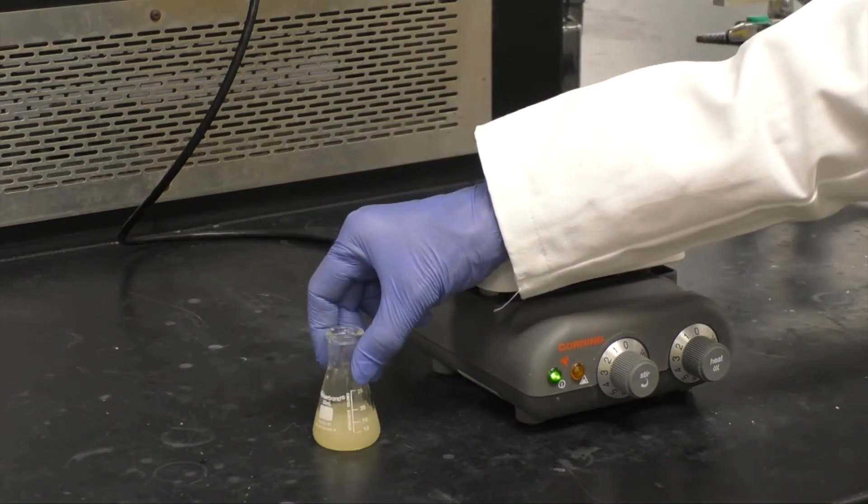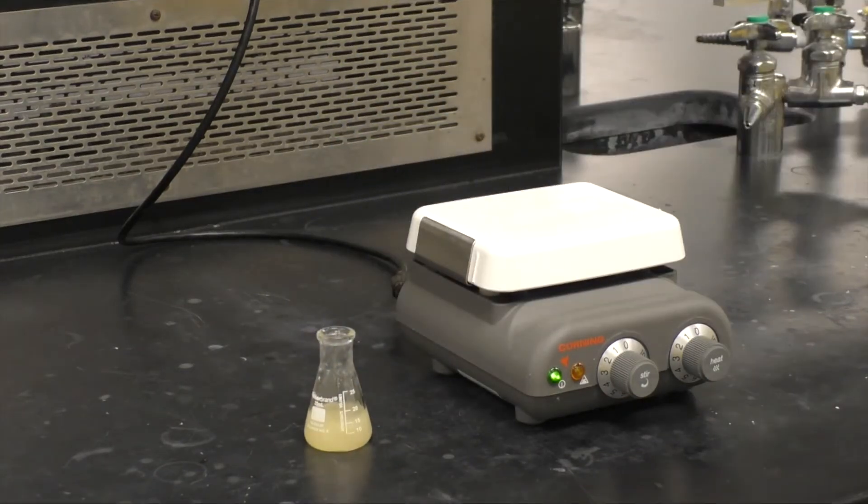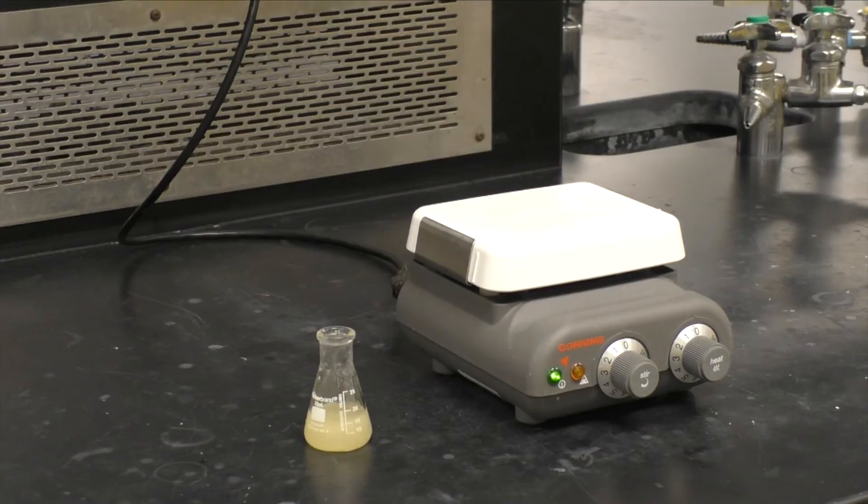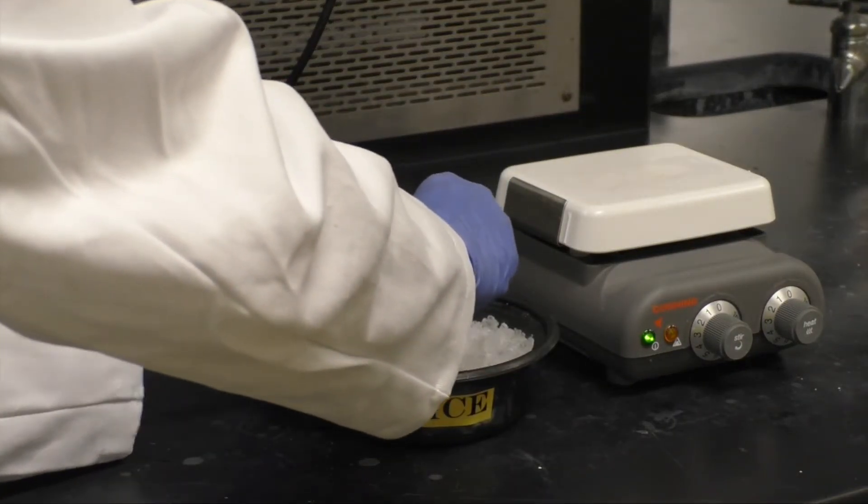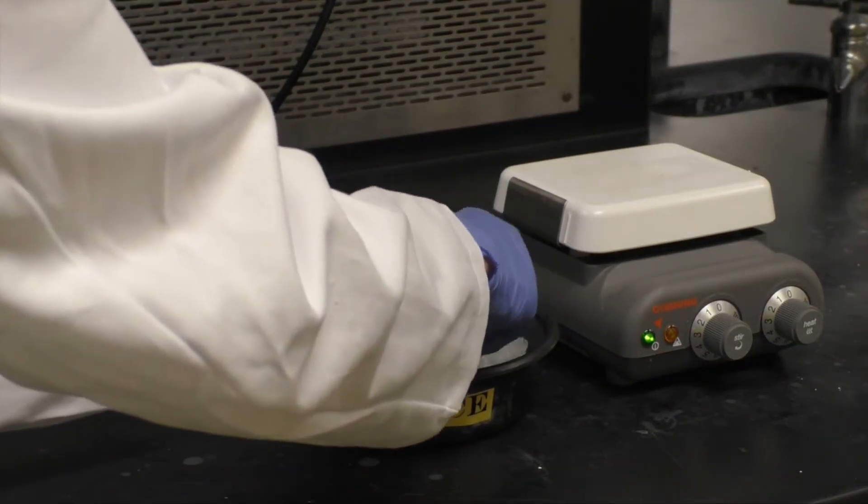Remove the flask and place it on the bench to cool to room temperature. Do not disturb the flask and crystals will form. Then place the flask in an ice bath for 30 minutes to allow crystallization to continue.